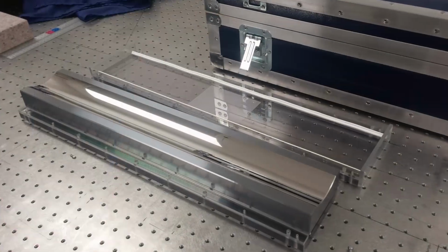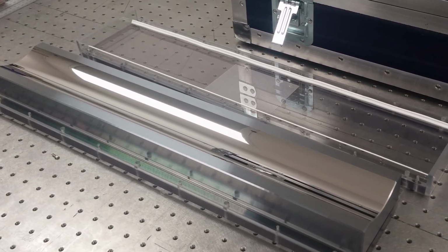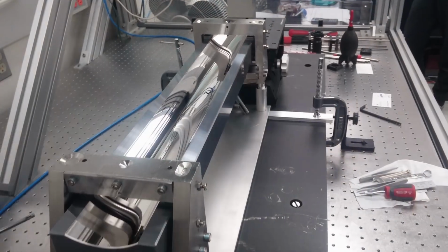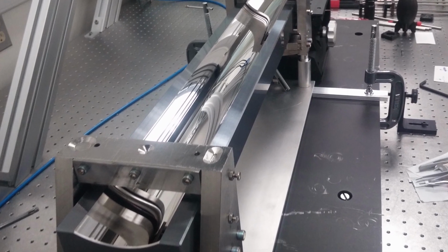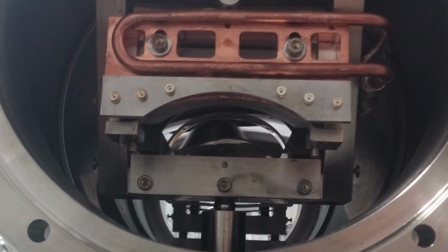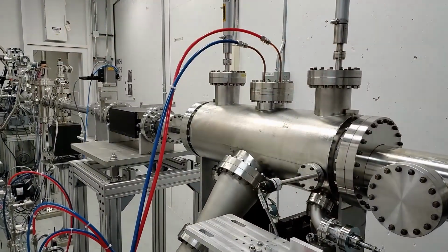It is a 60 cm long precision polished silicon mirror with a rhodium coating. It has a 6 cm radius to focus the beam horizontally and is installed in a bender mechanism that can be used to adjust the focus vertically by bending the mirror to a radius of a few kilometers. The mirror faces down and is aligned so that the X-rays reflect off the mirror at a very shallow angle, which is necessary so that the mirror does not absorb them.